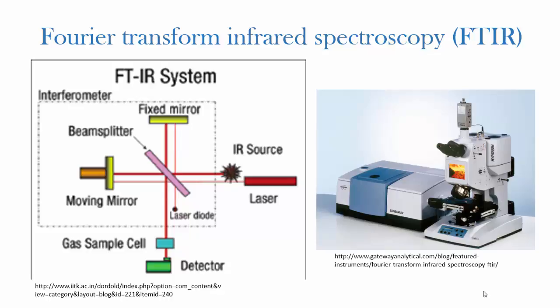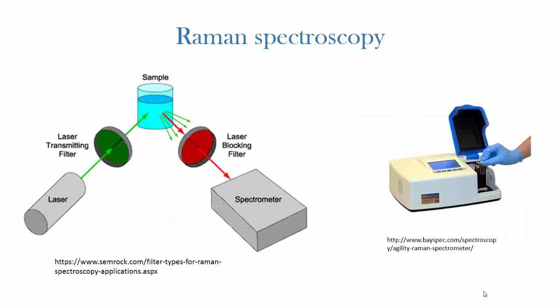In Fourier transform infrared spectroscopy, instead of shining a monochromatic light, a beam containing many frequencies is fired at the sample. The asymmetrical stretching that happens in the molecule is detected, and the amount of light absorbed is measured and done again with a different set of frequencies. The high spectral resolution data is then collected over a wide range by a computer, which gives the infrared spectrum.